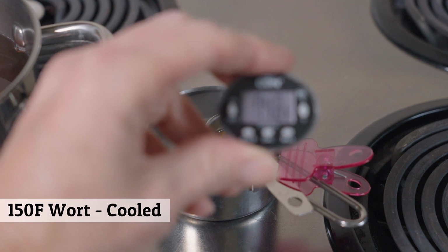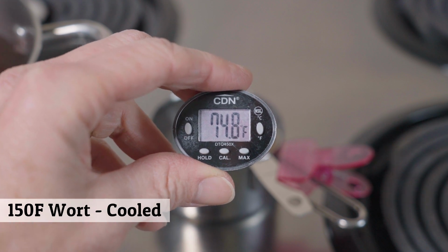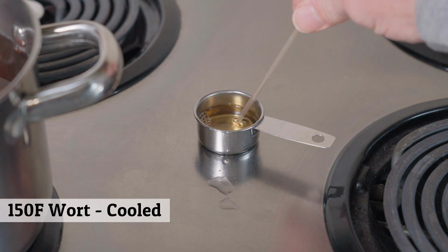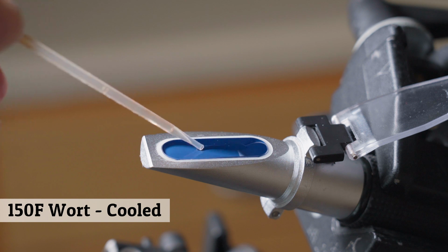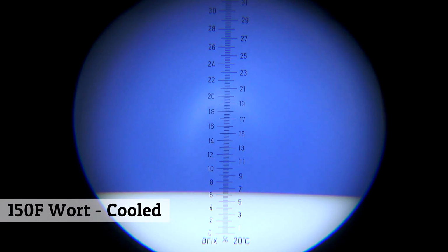Okay, so here's our sample that's been cooled. Just going to show the temperature there. It's roughly the same as our original wort sample. We'll go ahead and take a reading and put it on the platform. There we go, and it still looks like it's spot on, so that's good to know. This method seems like the better way to go, but direct measurement is always easier and faster. So it's good to know that you don't have to do this step if you do not want to at this temperature.